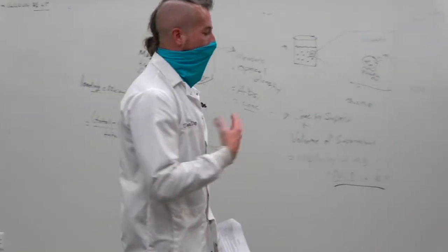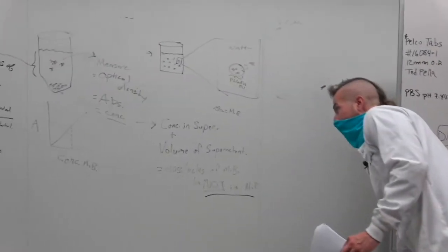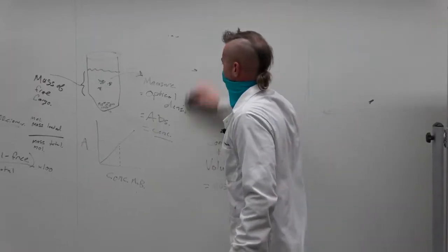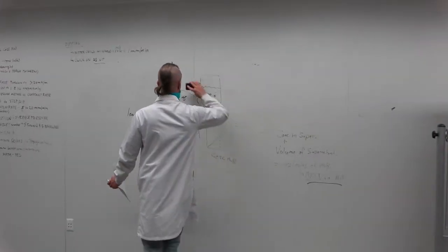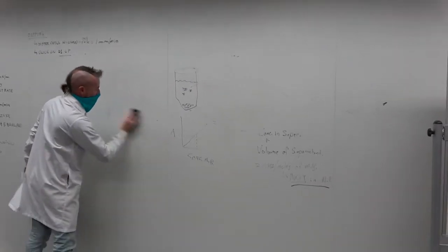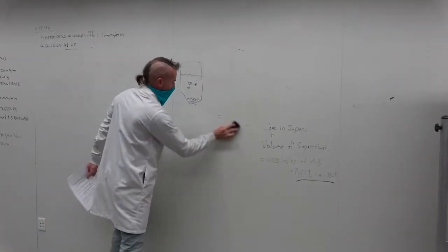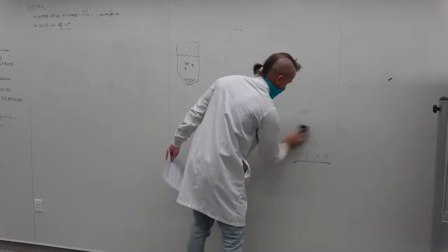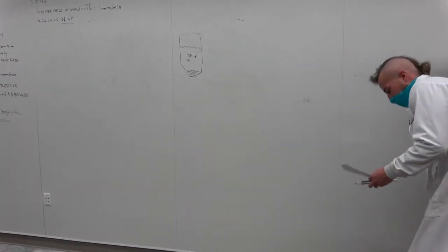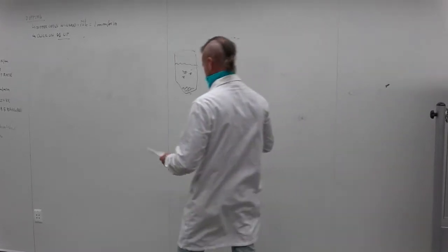Okay, the other way that people characterize how well the loading went is the loading capacity.